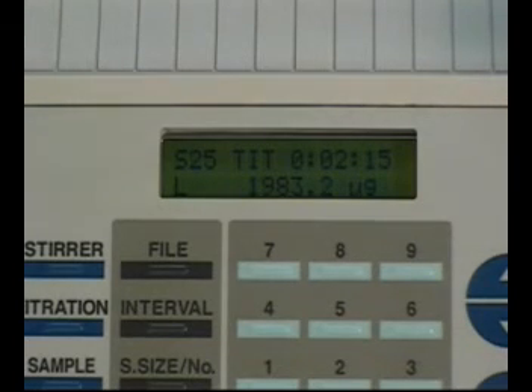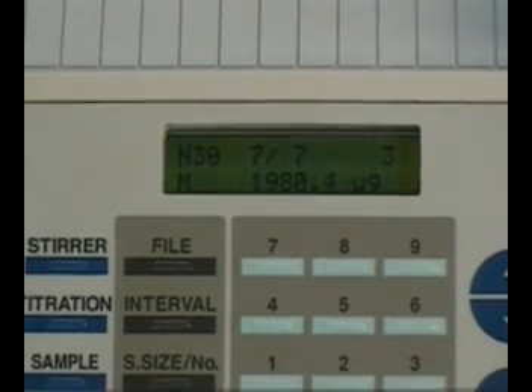This performance test should be performed three times and the average of the data should be within the range of 1950 to 2050 micrograms of water.